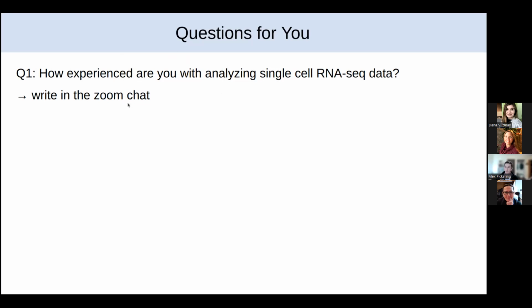So assuming we get that sorted, my next question for all of you is how experienced are you analyzing single-cell RNA-seq? Do you have a little bit of experience? Are you very experienced, or is this your first time? The reason I ask this is so that I can make sure I'm pitching the workshop at the right level, and so that I'm giving you plenty of time to answer the exercises.